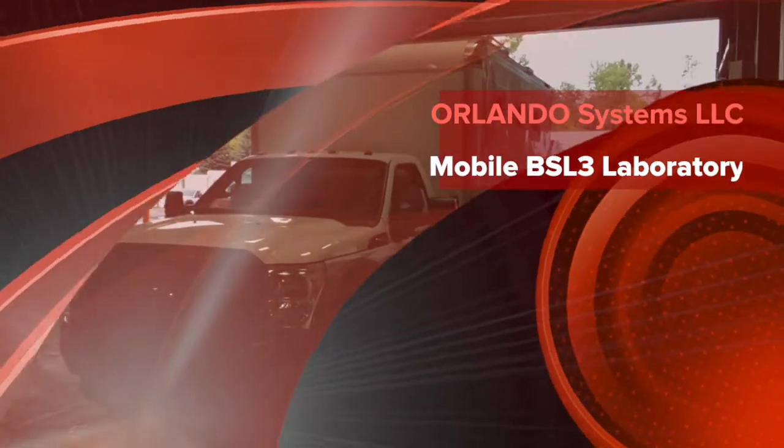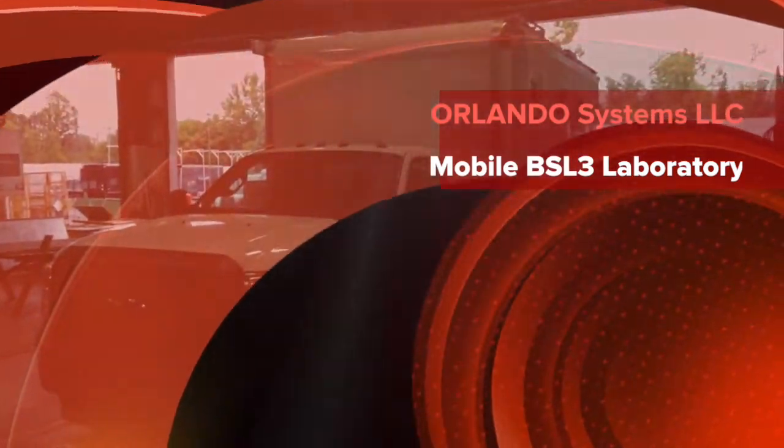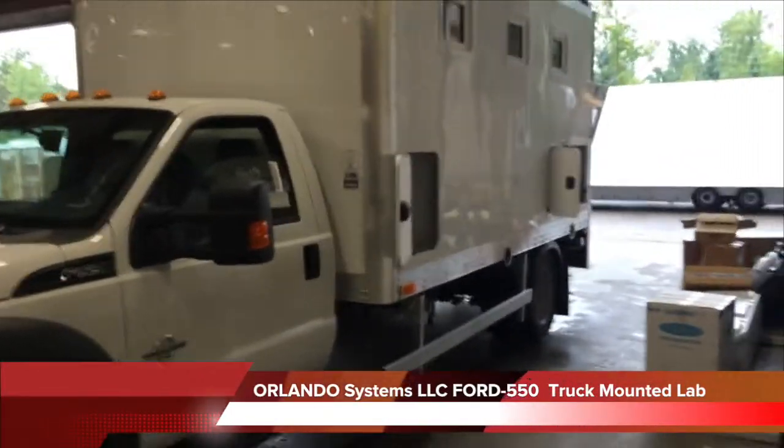In front of me I have the Orlando Systems Mobile Lab. The Mobile Lab is built on a Ford F550 International frame.